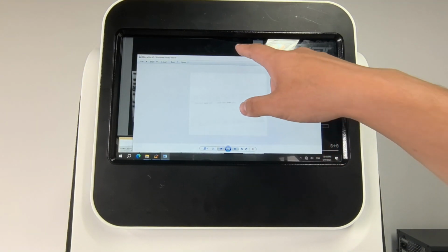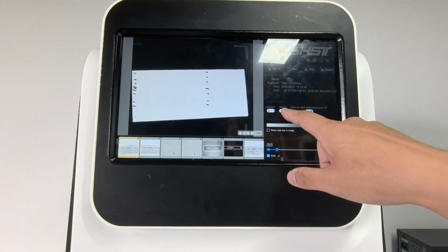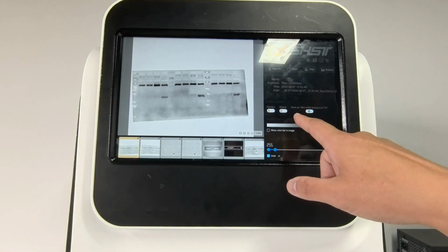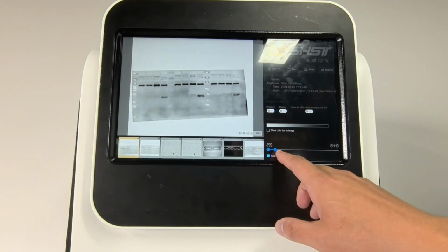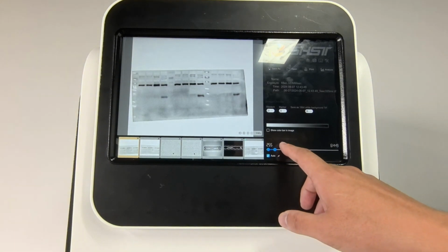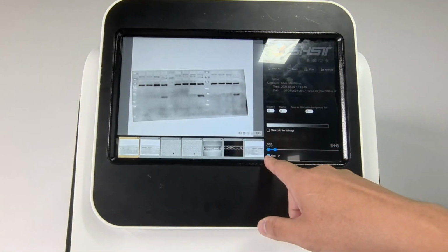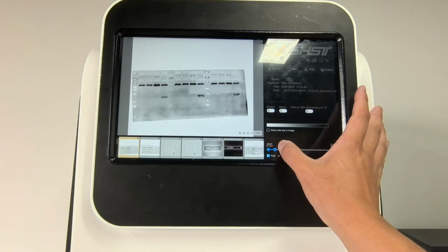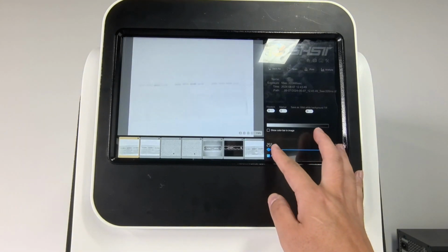This is normal because our software will provide, so let's see, this is the ChemiDoc image. Our software provides us the optimum gray display range. We have this function, especially if we click on this auto, but Windows does not provide such a function, because Windows will only provide the full dynamic range.